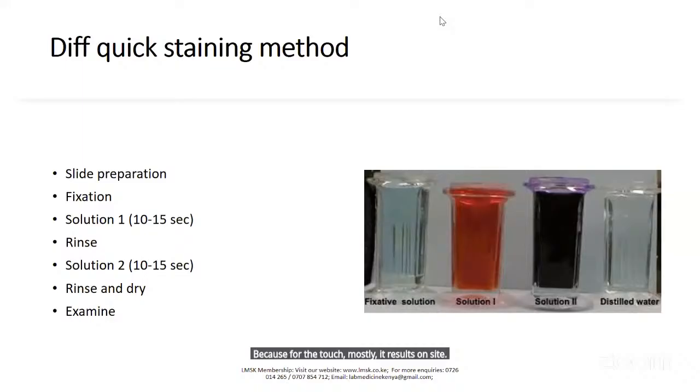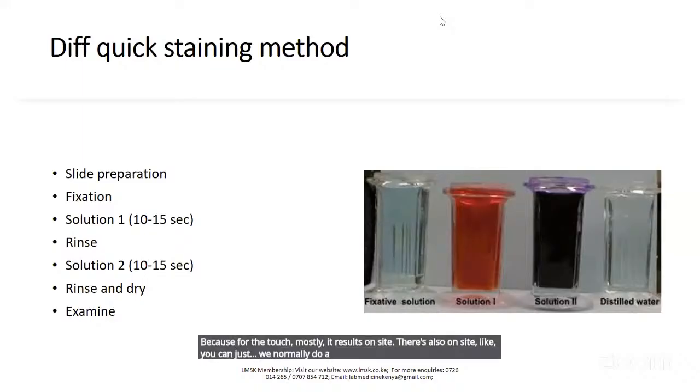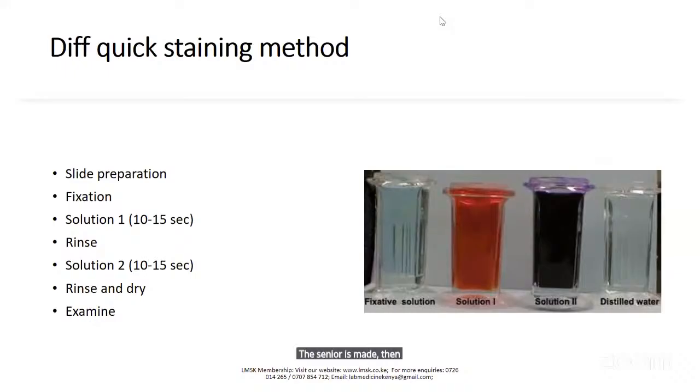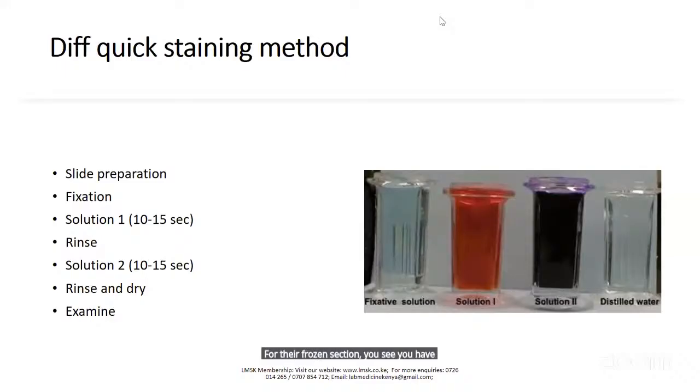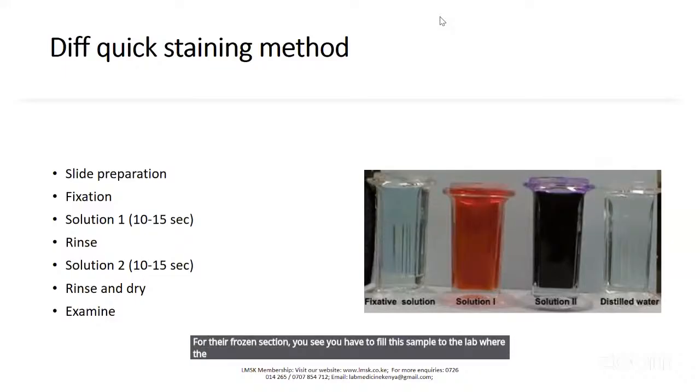We normally do a setup in the theater, just a place given in the theater, and the smear is made, then the pathologist is there reporting, and you have your results. So that one is very resourceful in results on site. For the frozen section, you have to ferry this sample to the lab where the cryostat is.